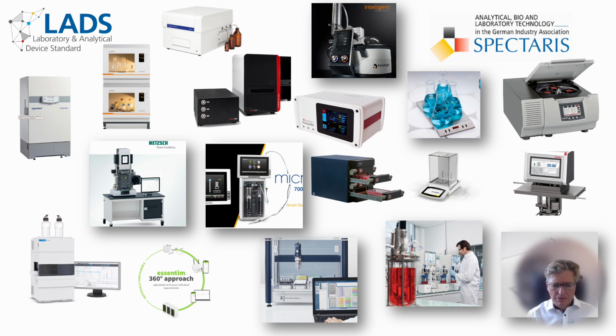To meet these demands, the integration of collaborative and mobile robots into laboratory workflows becomes essential. By combining automation with human expertise, we can achieve efficient and effective laboratory operations.